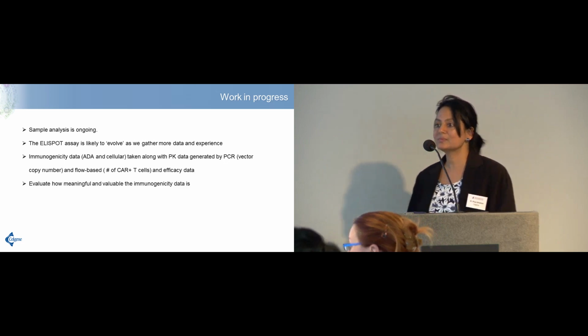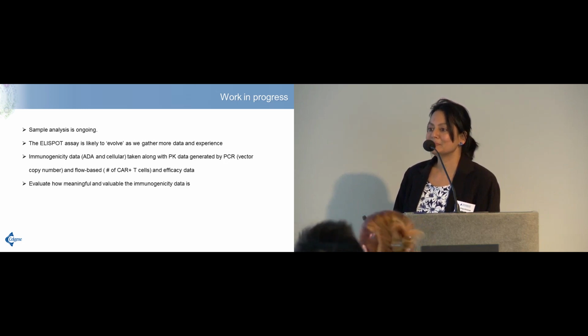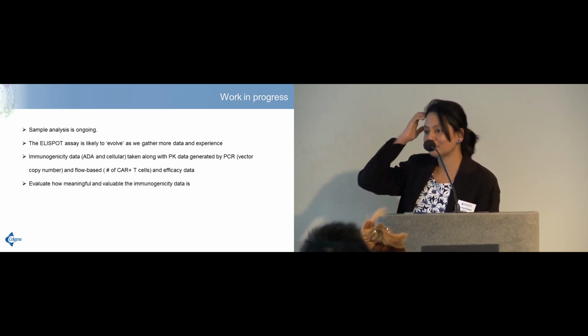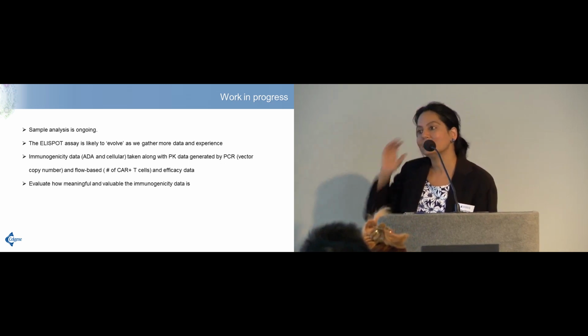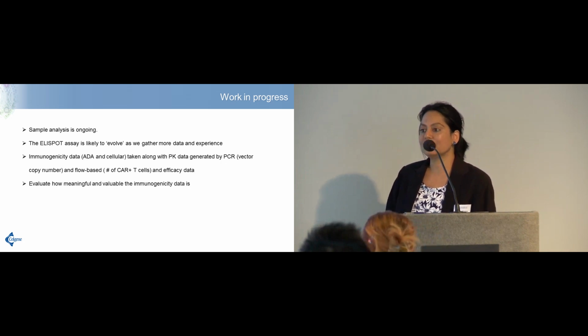Hi, very nice. I'm just curious about the peptide pool being 311 peptides. How was that achieved exactly? That sounds like a lot of peptides. Yeah, ProImmune had reservations about it. There was just no way out of it. We couldn't make smaller pools.